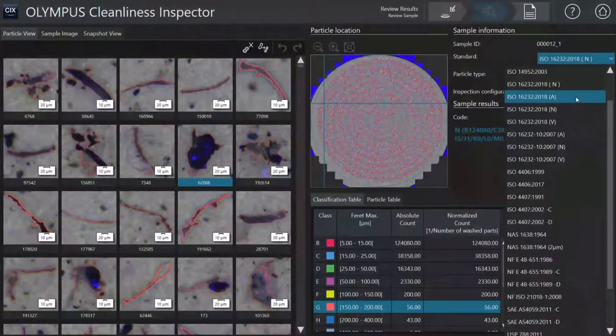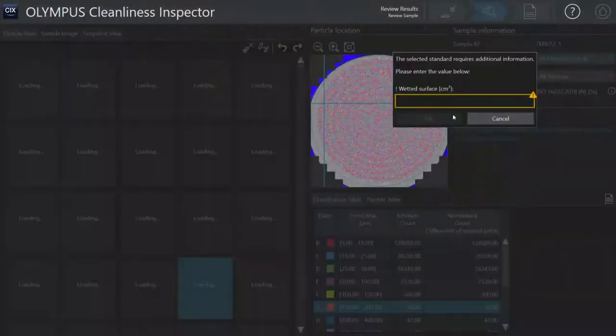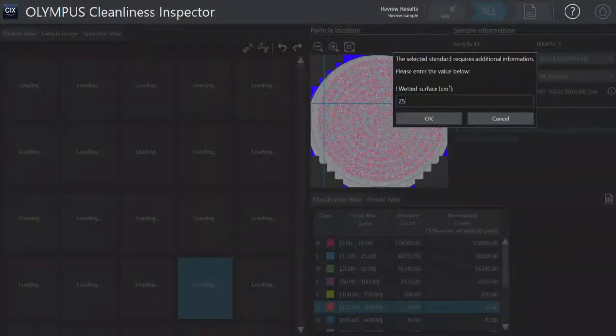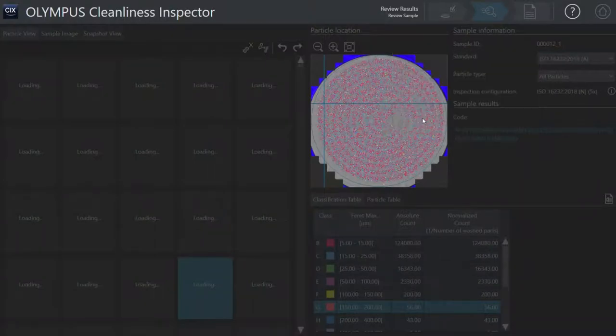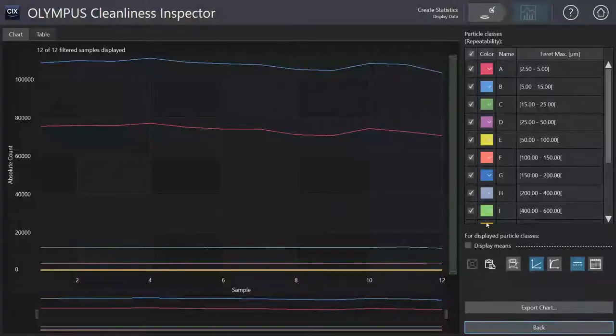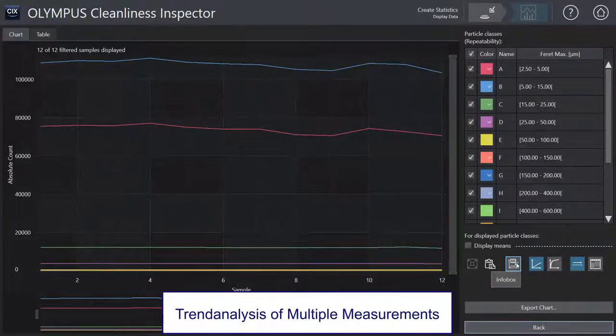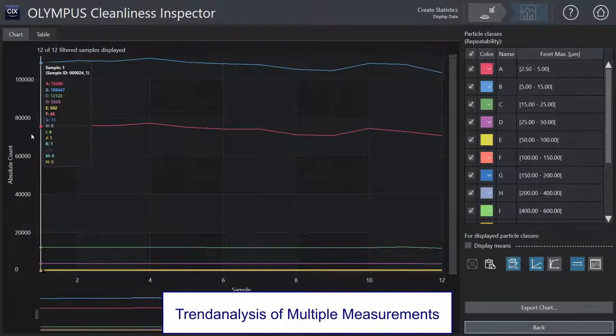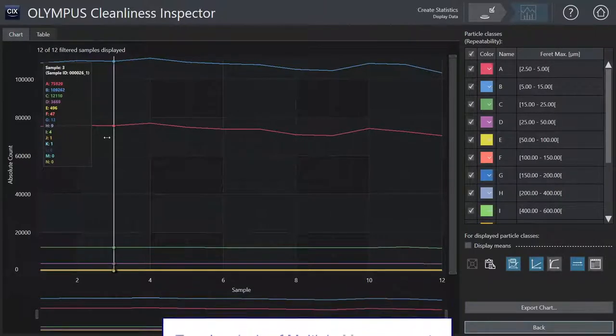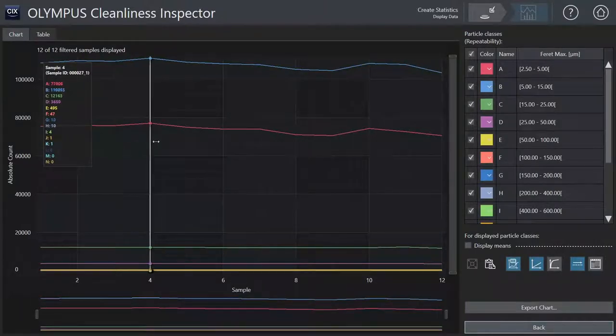Results can be recalculated to all standards with the click of a mouse. A specific statistic dialog includes powerful functionality for evaluating trends and contaminant data over time.